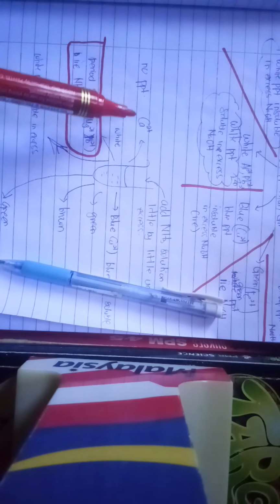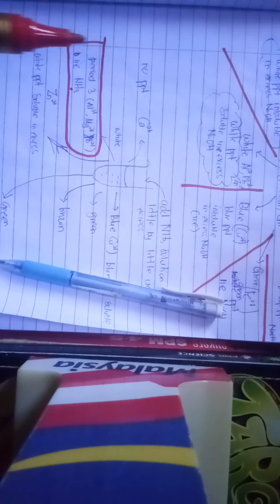But let's look at Ca. Ca is group 2. If you put ammonia in Ca, nothing changes, or you can say no precipitate. You cannot see a reaction. Nothing can be seen if you have Ca2+. Next, the other white one is zinc.